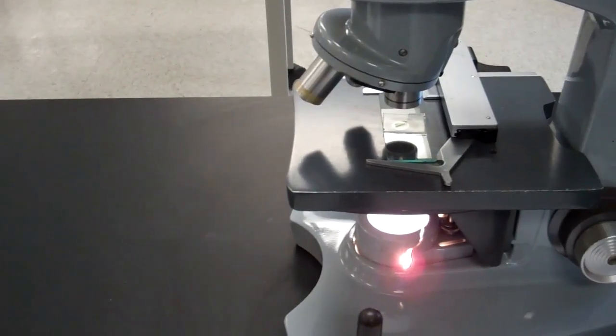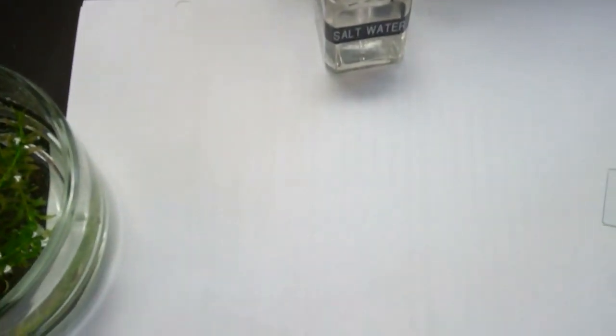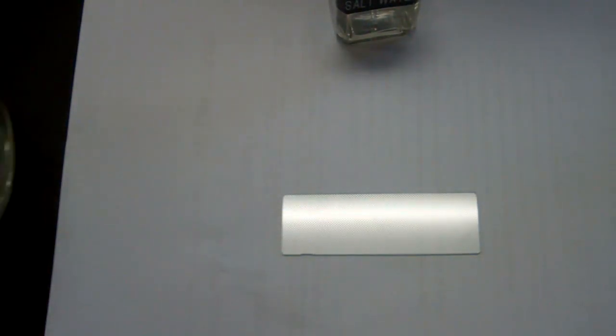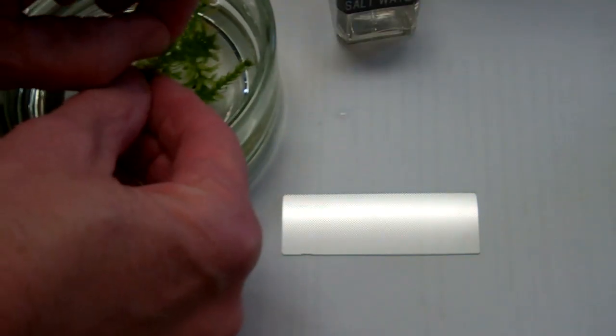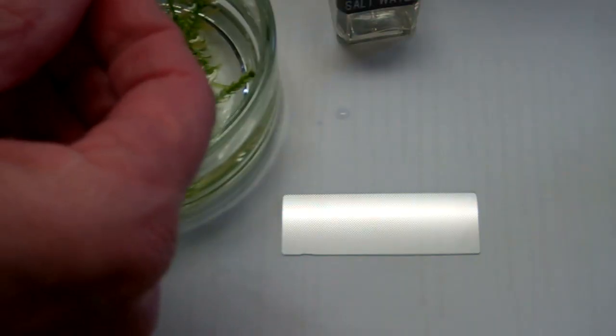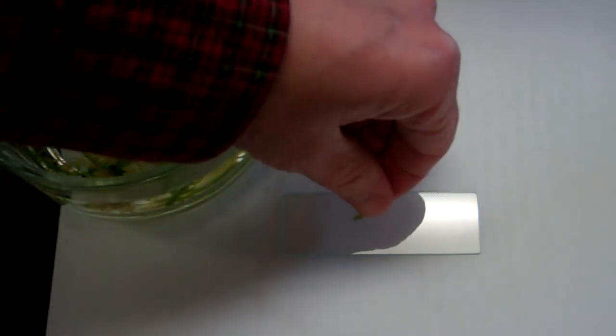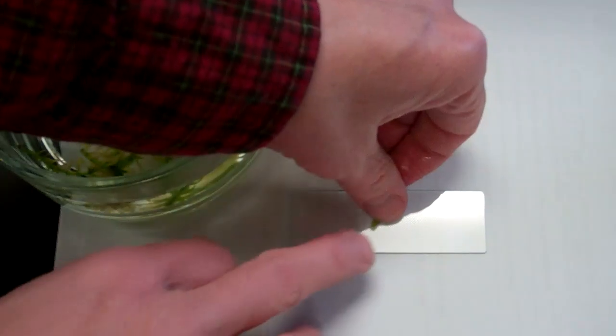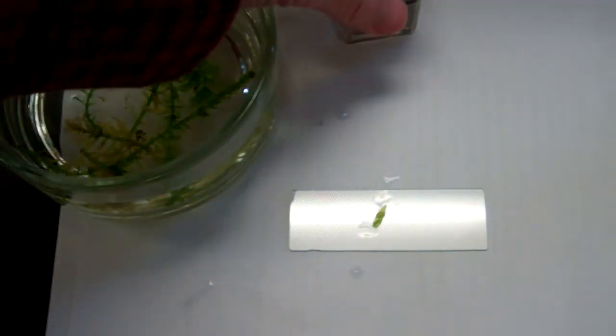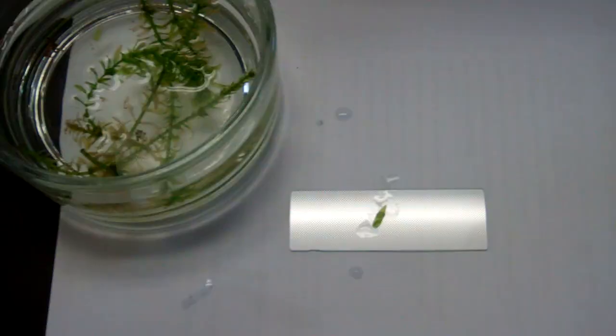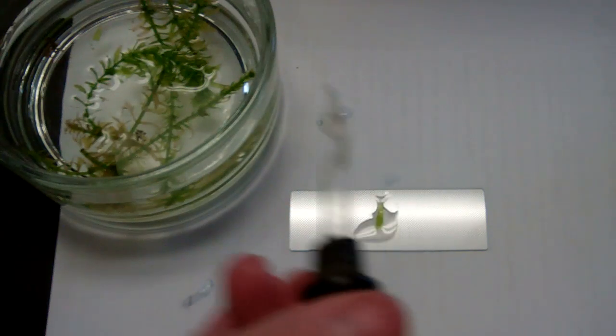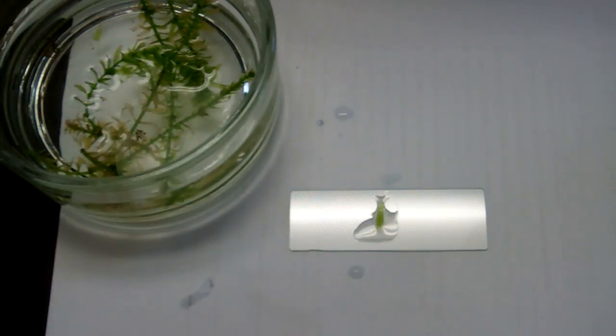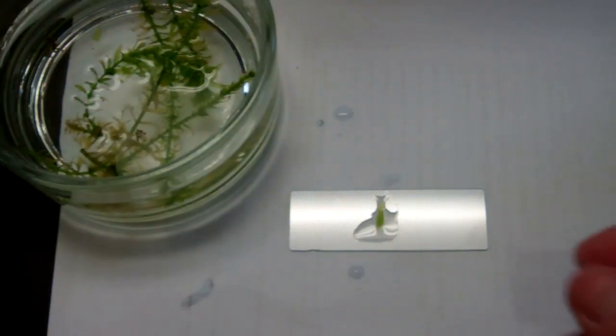Now, a different situation will be when you look at Elodea in salt water. So, again, we're going to take a slide and our Elodea leaflet. A little tiny leaf, single leaf. So thin that you can see through it. And now we're going to put salt water on this leaf. And this is not the normal type of water environment for this plant. And we put our cover slip on it.